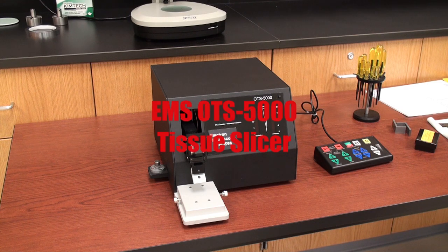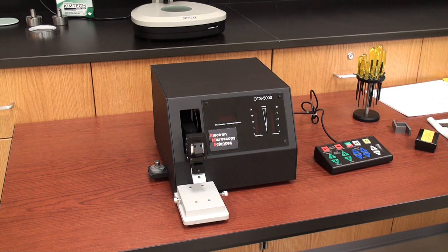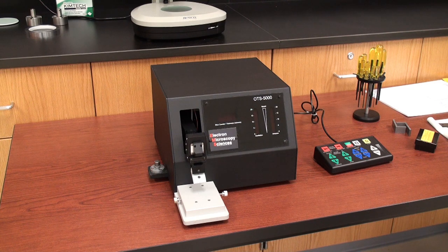This is what the unit looks like on your desktop, the main unit and the control box. Now let's have a quick look at all the accessories that come with the 5000 model.